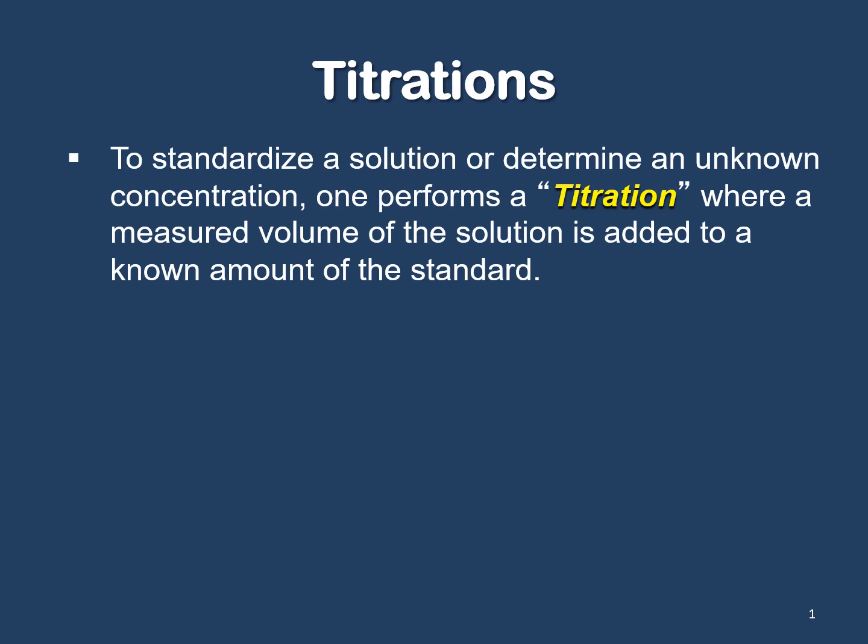Usually we use a titration to do something called standardizing a solution, which is basically make the solution, then we standardize it to know its exact concentration. Or maybe we don't know what the concentration of an acid or a base is in a solution, and we want to figure out what the concentration of this unknown thing in the system is. Well, we could perform a titration.